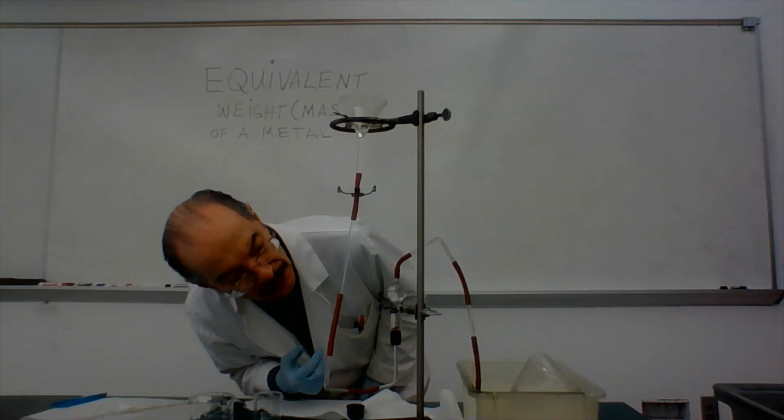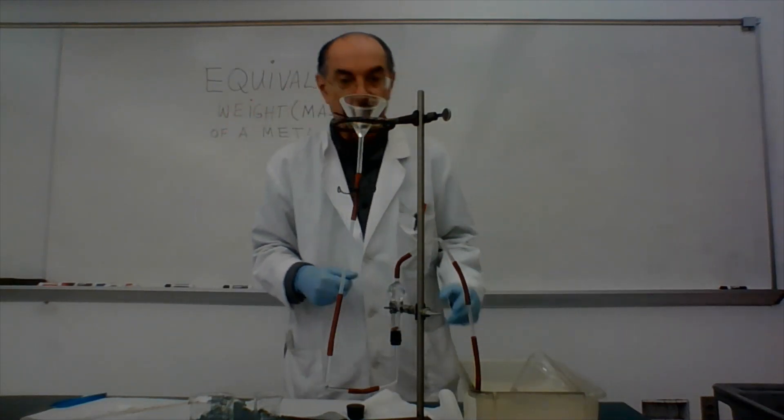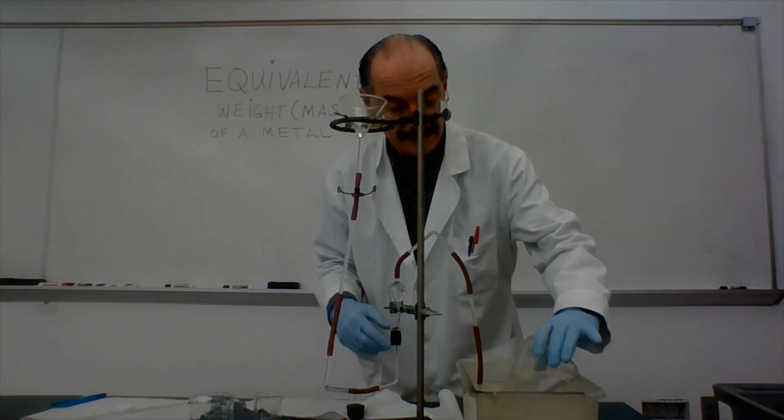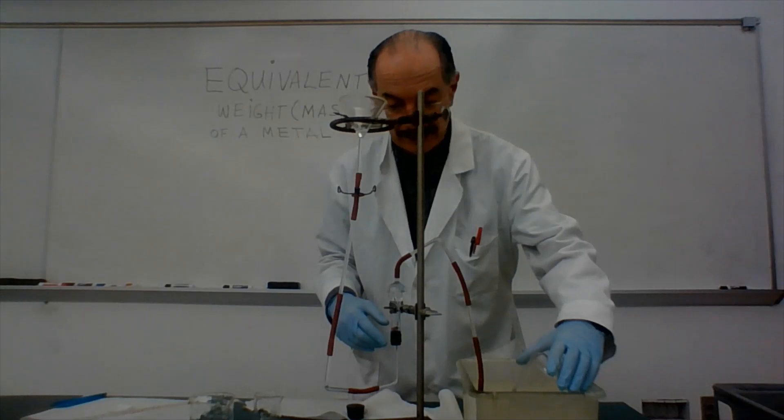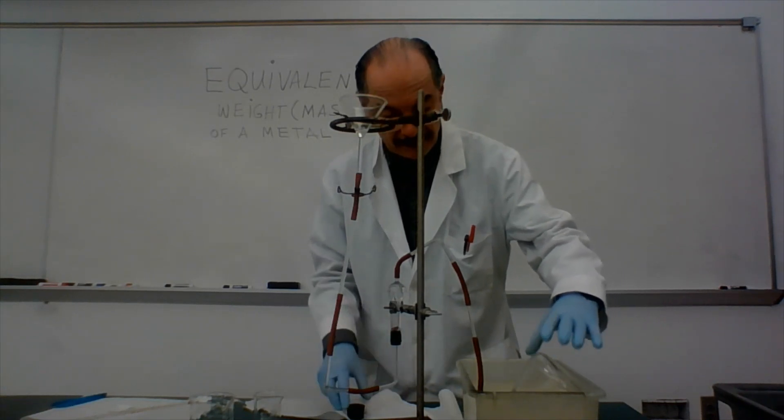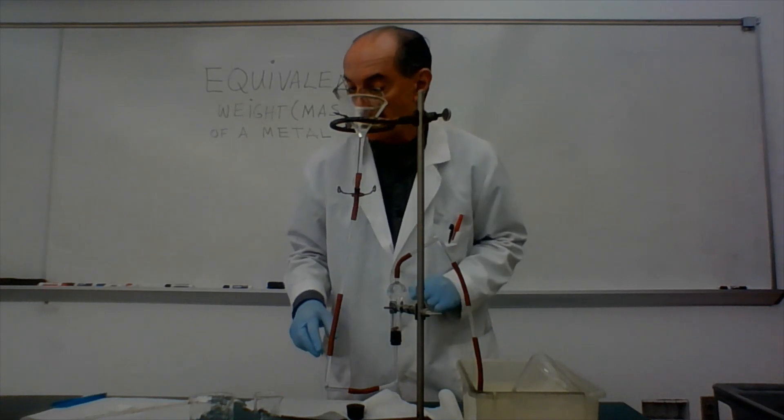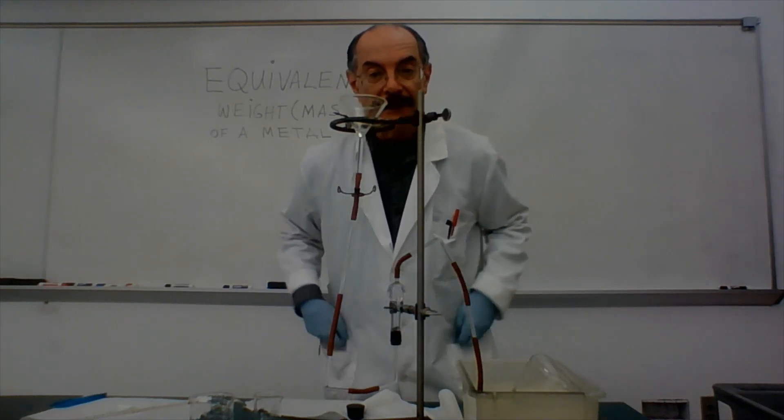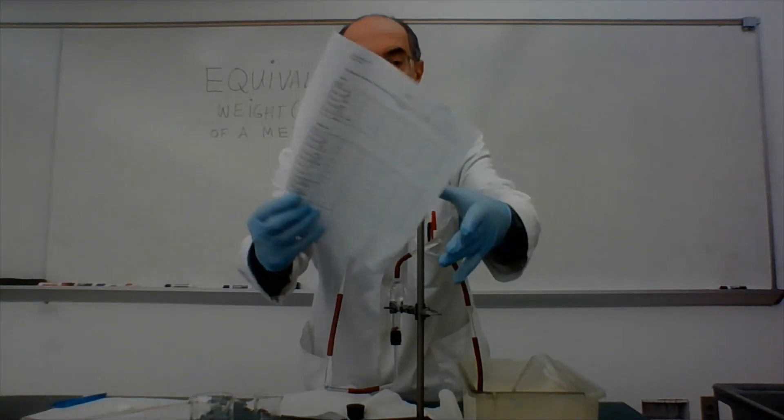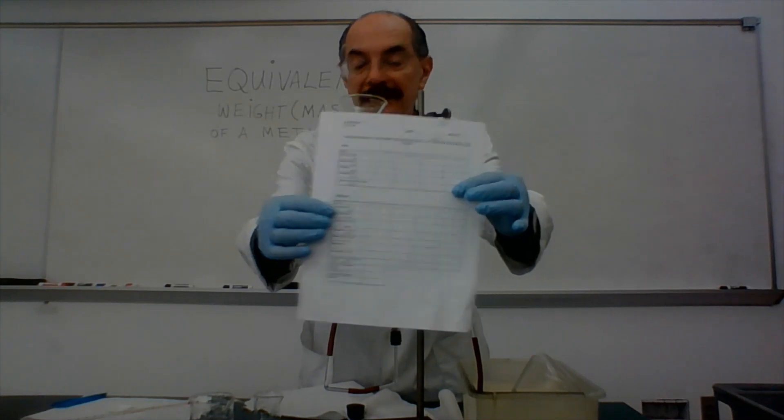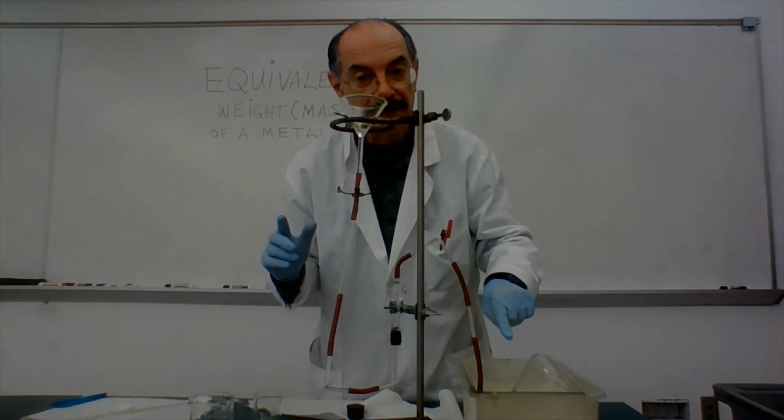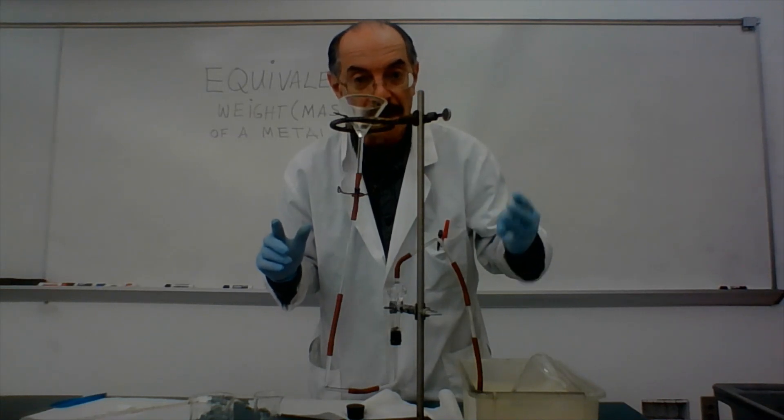I want to make a visual inspection to make sure that all of the metal is gone, so it all reacted. And so now what I have is in my flask over here, I have a collection of big bubble of hydrogen gas in there. Of course, you would be doing this in the fume hood to make sure that everything's okay. So what we're going to do now is we want to measure out how much water was left in the flask. And I just realized that, one second. Once more, this is your apparatus. On your data, you wanted to make sure that you put in the volume of water left in the flask, the temperature and stuff. But remember, the idea here is I want to know how much hydrogen is in there by knowing what is its volume, what is its pressure, and what is its temperature.